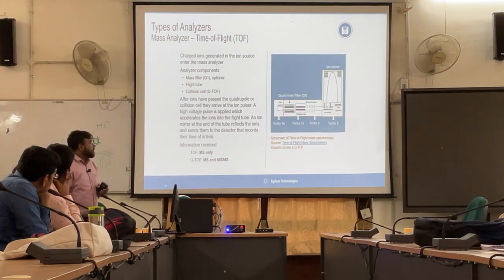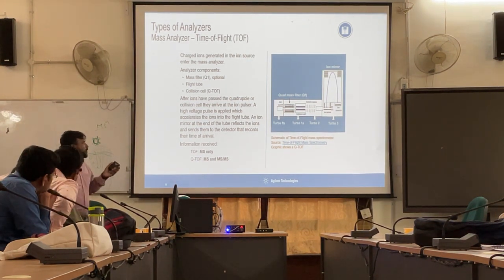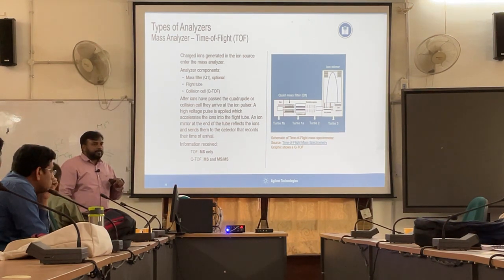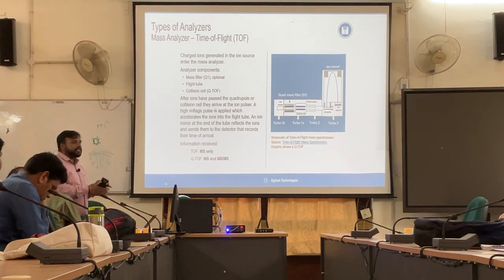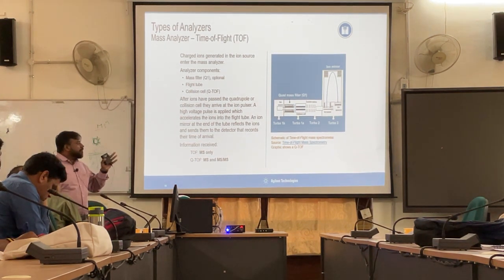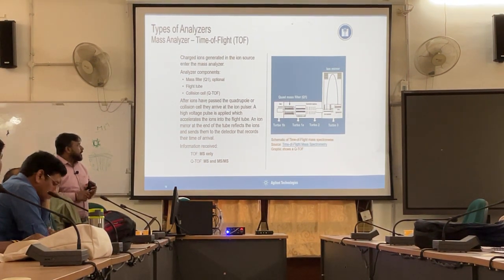Now on top of that, the instrument we have in FRI is the LCMS QTOF. QTOF is nothing but an HRMS, so we have a high mass resolution instrument. How is this going to be differentiated from the single quadrupole and triple quadrupole? We have the TOF here, and this TOF gives you high mass accuracy and high resolution mass data.